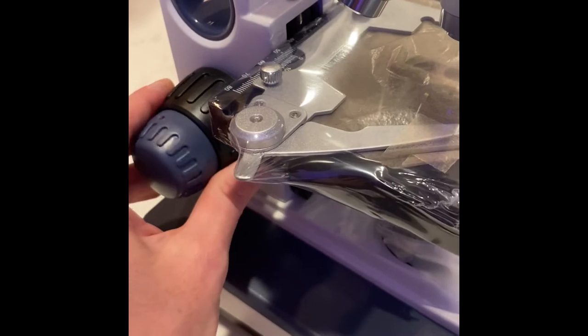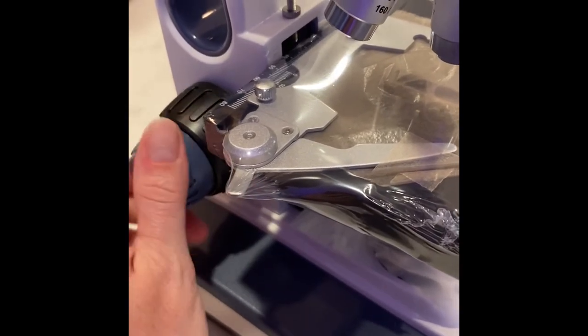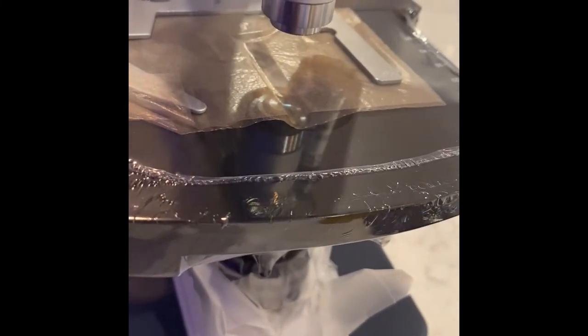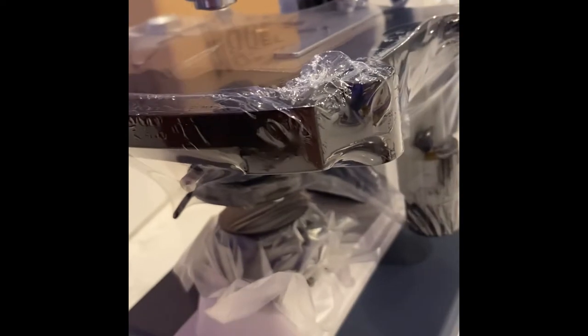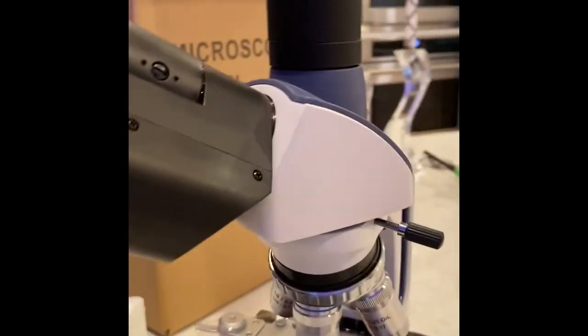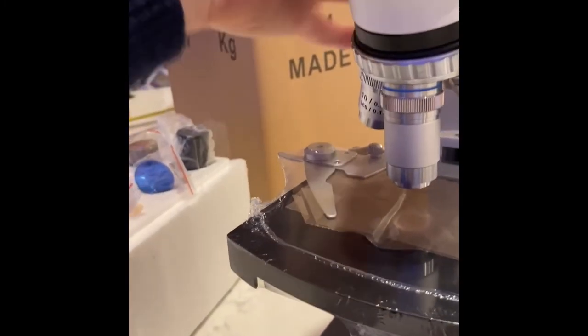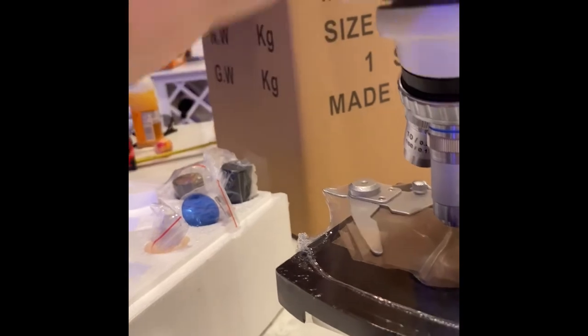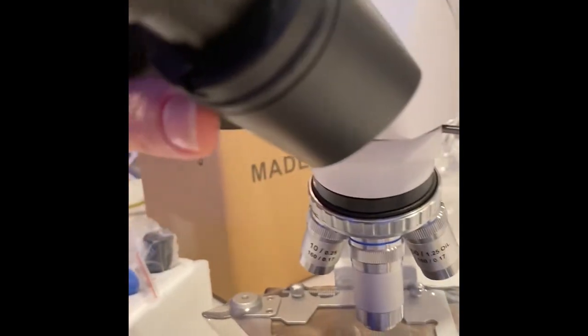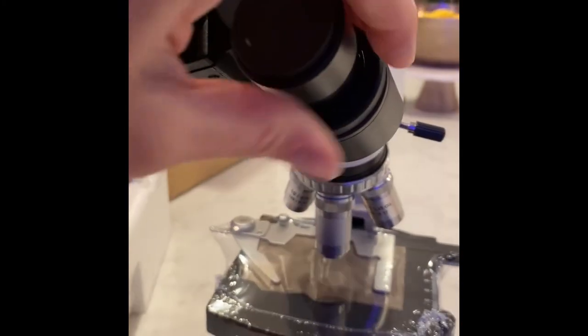So this has a really nice coarse and fine adjustment knob. It's very smooth, which is just really nice. Everything I would want on a stage, so. This should move it from left to right and front to back, so that way you can kind of position where you want to be on your lens. And yeah, very, very happy with this. Now it's making a little bit of noise whenever I do it, so I might need to end up having to tighten it up. This looks like it's part of the problem. So nice 360 degree rotation, so can move these.